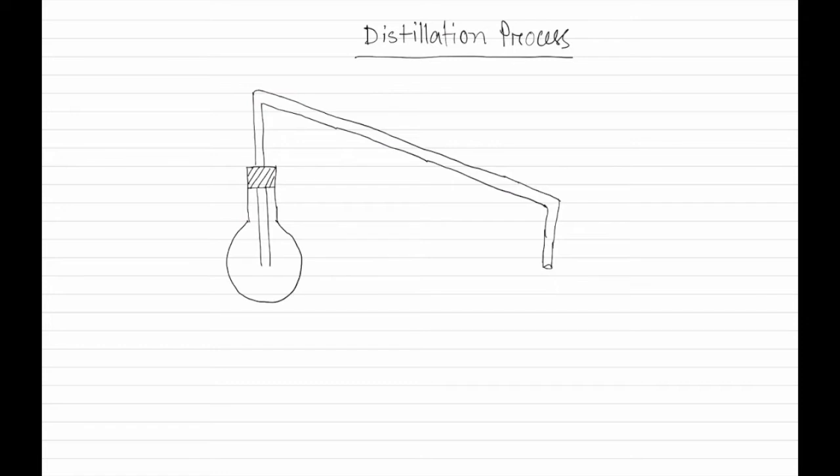A delivery tube or glass tube, and this distillation apparatus or pitcher is connected with a tripod stand. You can connect with a tripod stand, a three-legged stand containing a table. At the surface of the table it contains a wire net. For this reason, the pitcher can easily be set on the top of the table.